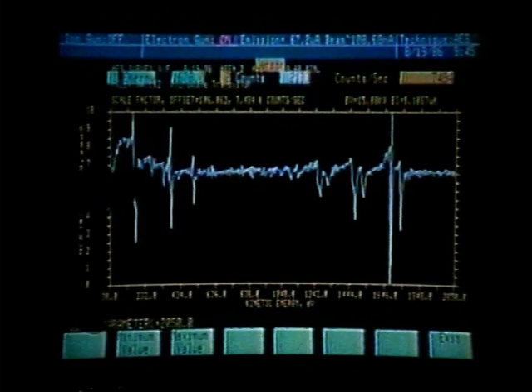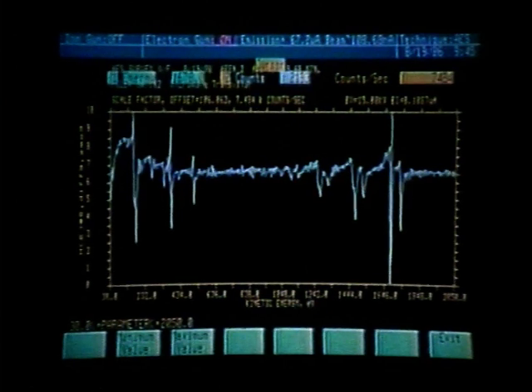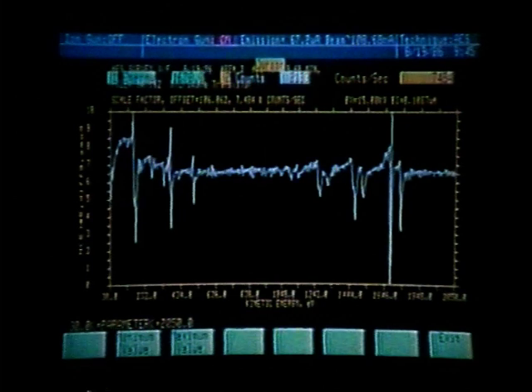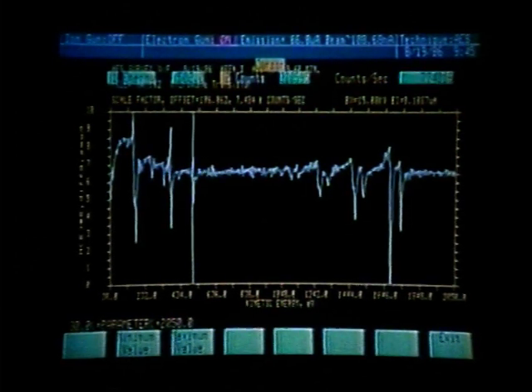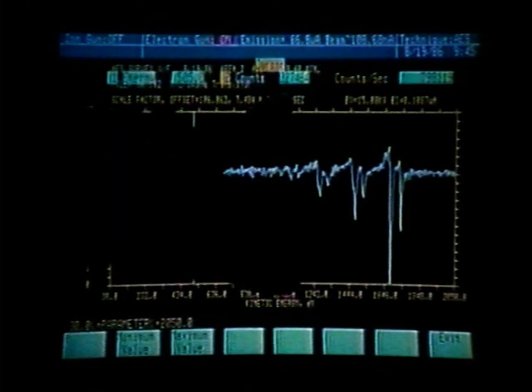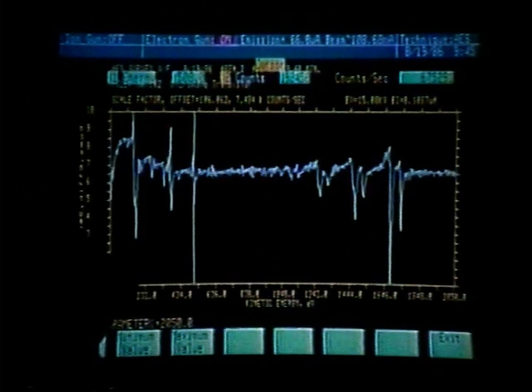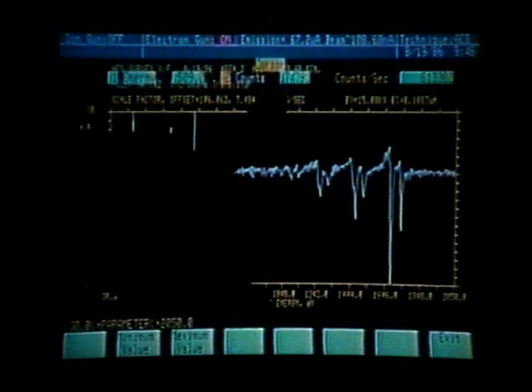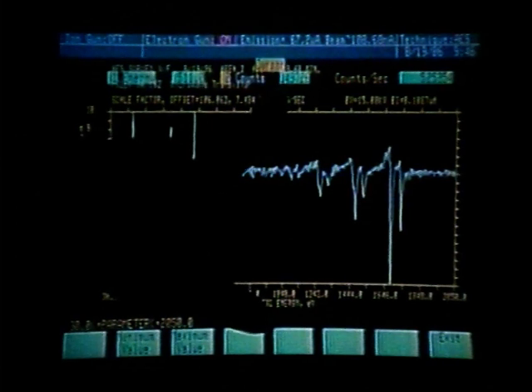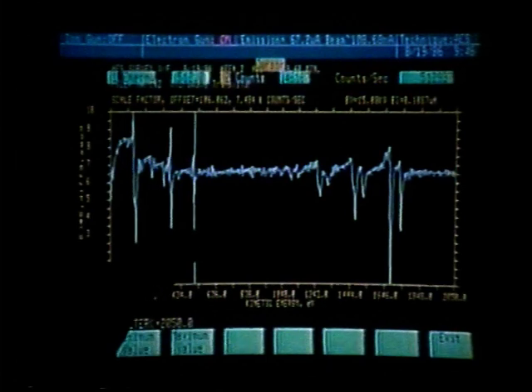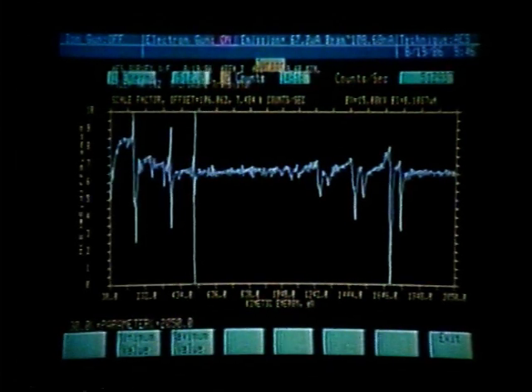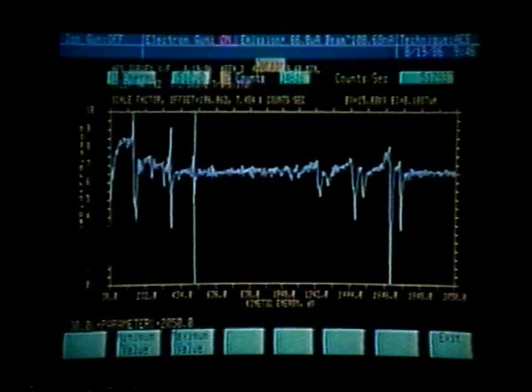Eliminating the tantalum peaks, we still have three major peaks to identify. There is one around 500, so we enter the value 500 to move the cursor close to that peak's negative excursion. Using the arrow keys and watching the counts, we find: 192,000 counts, 174, 159, 149, 146, and 148 — so the negative excursion is at 146 with an energy of 512. Referring to the handbook, we can identify that as the oxygen peak. We now want to identify the next peak by finding its negative excursion.